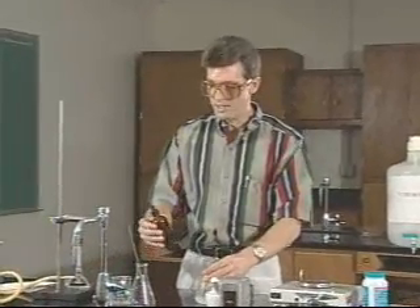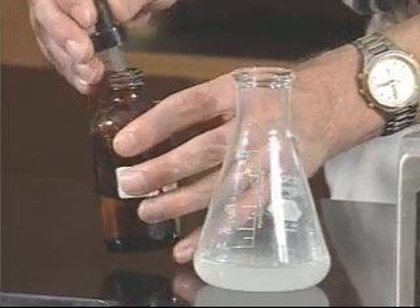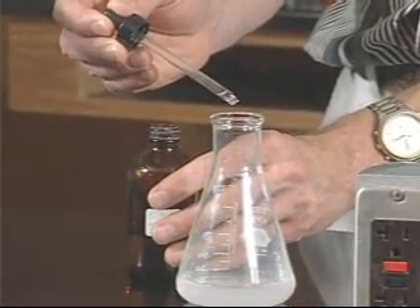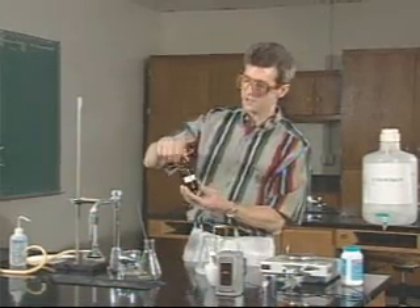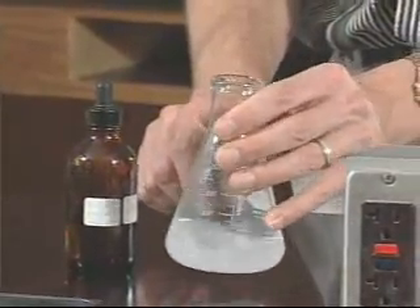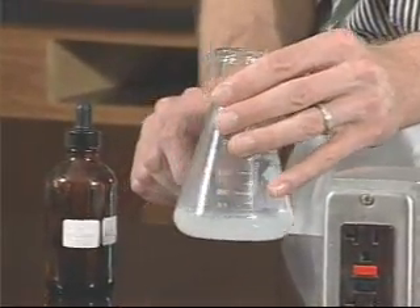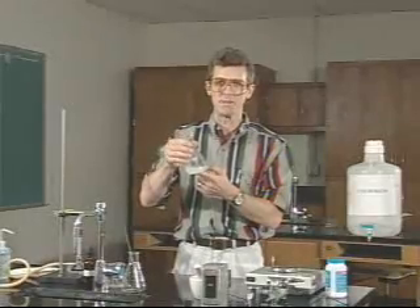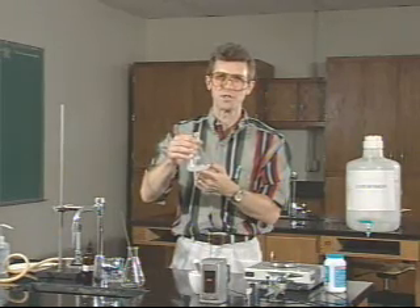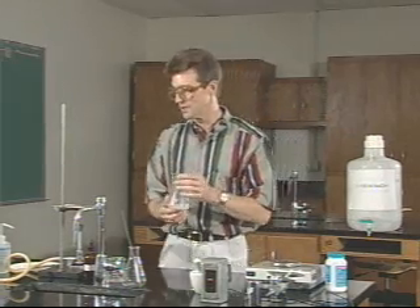Before we proceed any further, we need to add an indicator — phenolphthalein. This will be in the hood at the back of the lab. We need three drops. This is designed to turn colors when all of the excess acid in our flask has been used up during the titration. Right now there should be no color change, and in fact there isn't. If it turns pink, it means that not enough acid was added to the antacid material, and you need to start again using a smaller amount. That it is clear is good, and we can continue on.